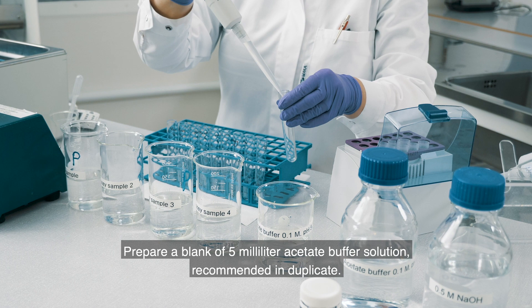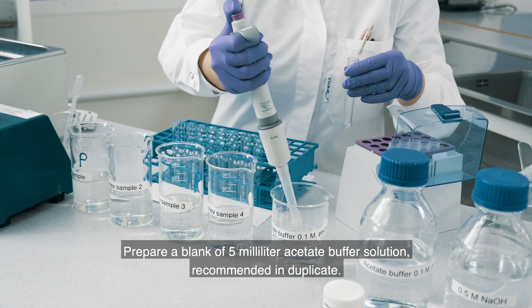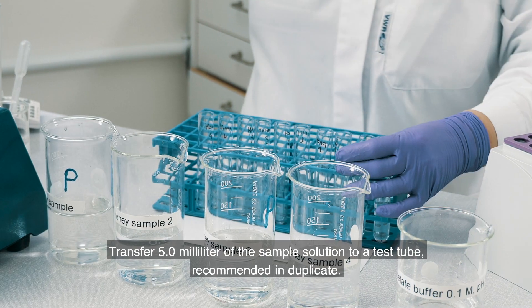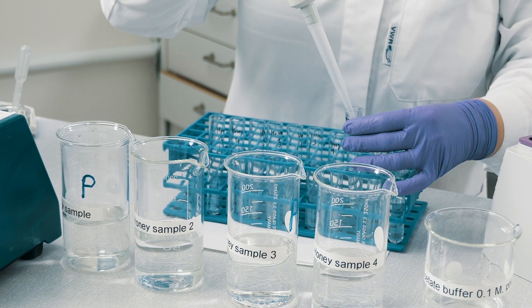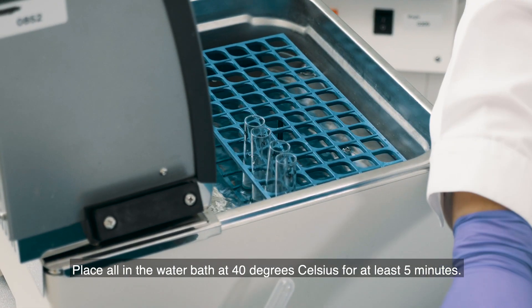Prepare a blank of 5 milliliter acetate buffer solution, recommended in duplicate. Transfer 5.0 milliliter of the sample solution to a test tube, recommended in duplicate. Place all in the water bath at 40 degrees Celsius for at least 5 minutes.